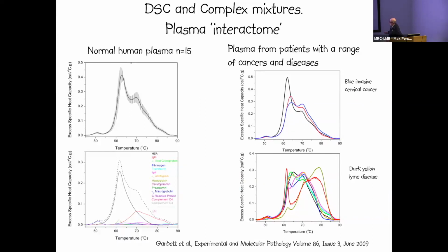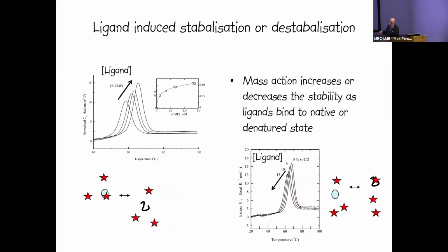What they argue in this paper and subsequently in other publications is that this doesn't represent a change in the levels of these proteins, but that during disease processes, the very low levels of metabolites, products and other components associated with the disease interact with the proteins present normally in the plasma and generate some sort of thermal shift, decrease or increase in stability.